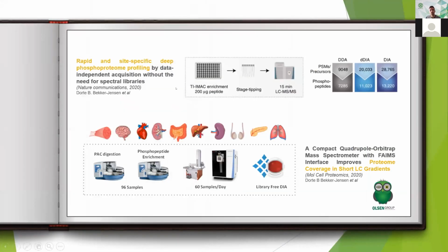And DIA for us was a major game changer, similar to many labs in the proteomics world. Mostly because a large bottleneck was largely removed at the LCMS stage, where previously we had analysis of between 60 and in excess of 180 minutes. Now with DIA, we see runtimes down to 5 minutes with very deep proteome coverage. So that firmly puts the spotlight back on sample prep. Having high throughput and efficient sample prep was no longer a luxury, but an absolute necessity.